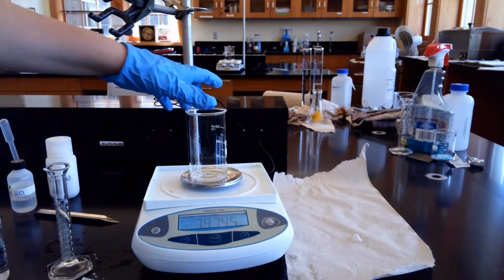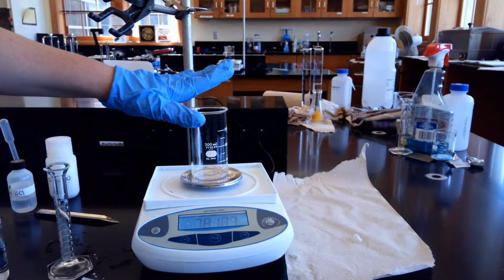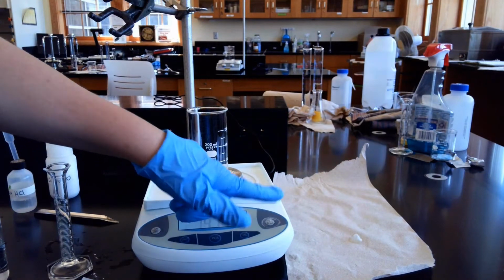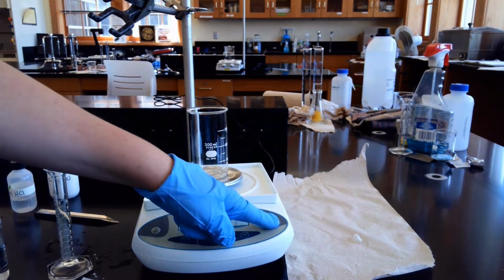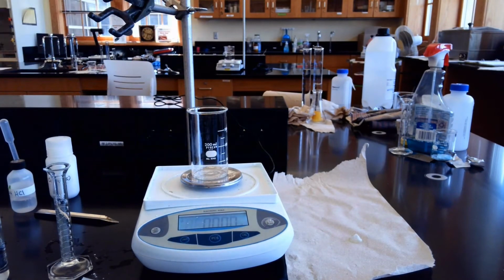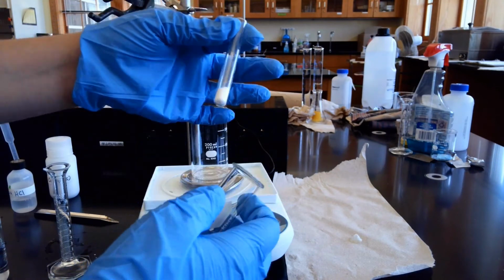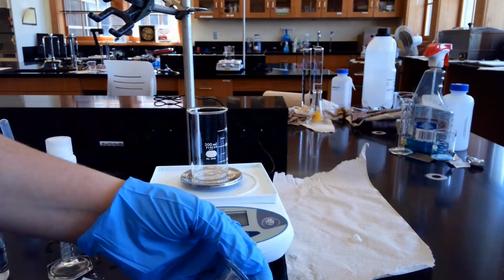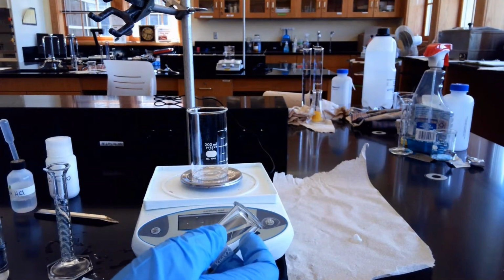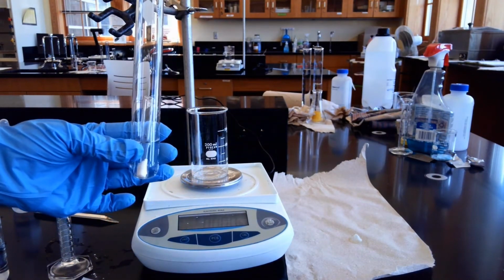So first of all, I'm going to take this beaker, and this is just going to sit here for us. We're going to tare it. This way we can get the weight and the mass of our gas generator. So we'll tare. And now we're going to slide in. So we're going to tilt this on its side, tilt this here, and we're going to carefully slide this in. We don't really want it to splash. And there you have it, in without mixing.